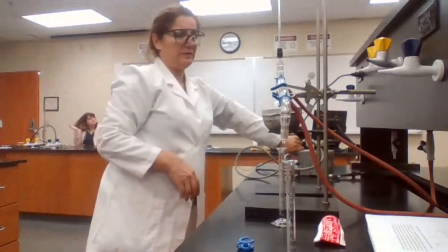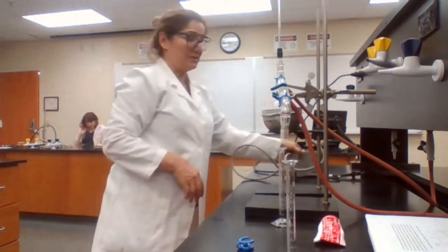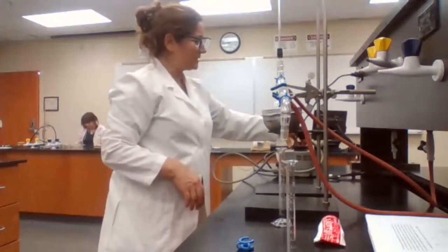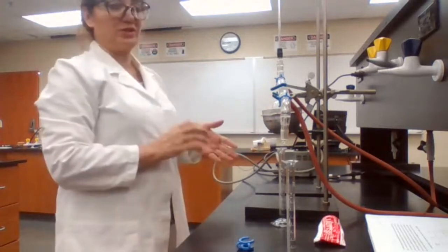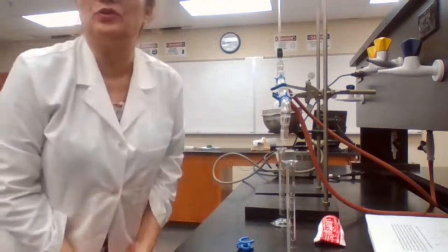Then you turn on the heat. You can adjust the power regulator higher to begin with, like between 60 and 70. As soon as you see your sample starts boiling, then you can lower it for gentle boiling. What happens if you heat it up too fast?